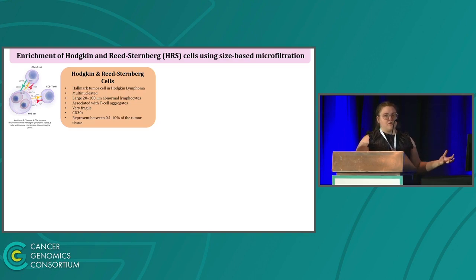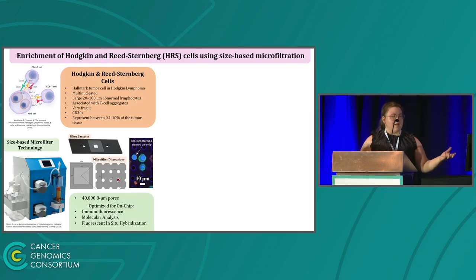All of these characteristics make these cells very challenging to isolate at a high enough yield to do a lot of clinical assays and sequencing experiments feasibly and also reproducibly. So we sought out this size-based microfilter technology to address some of these challenges.